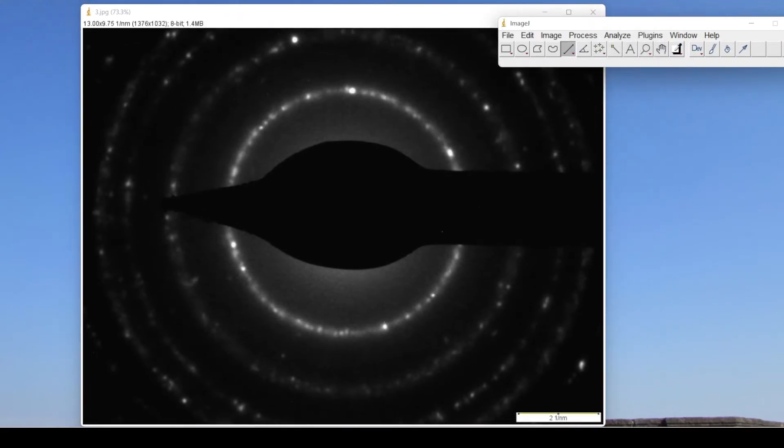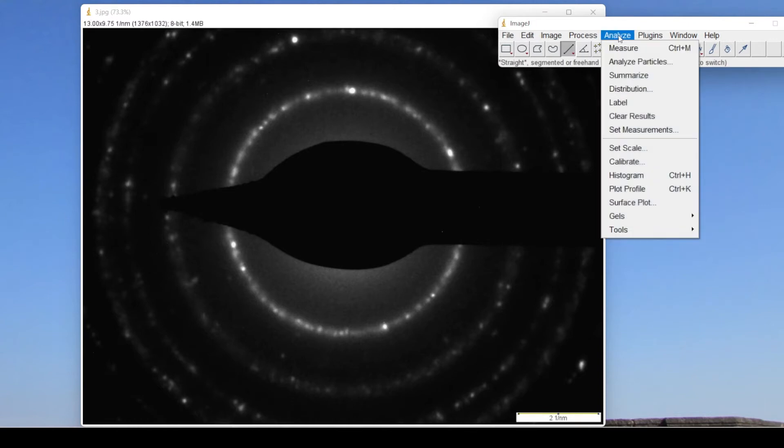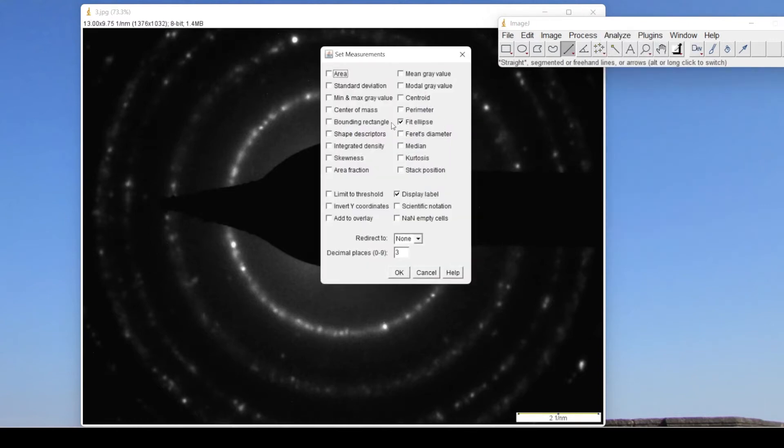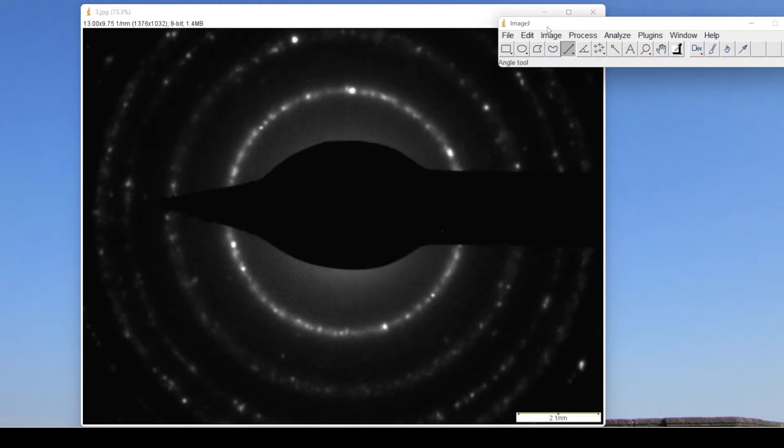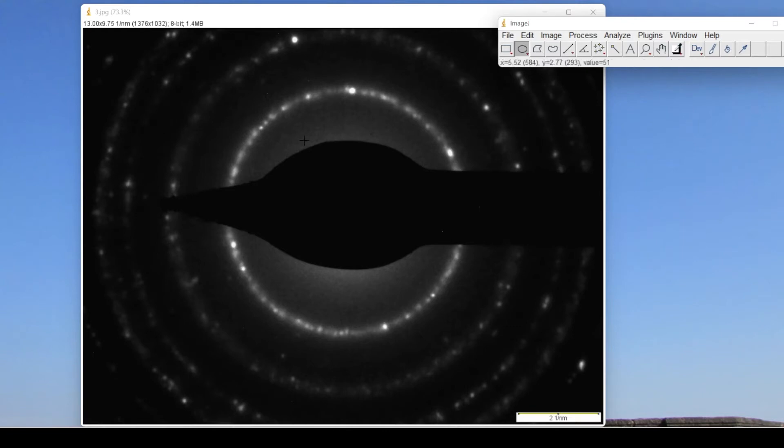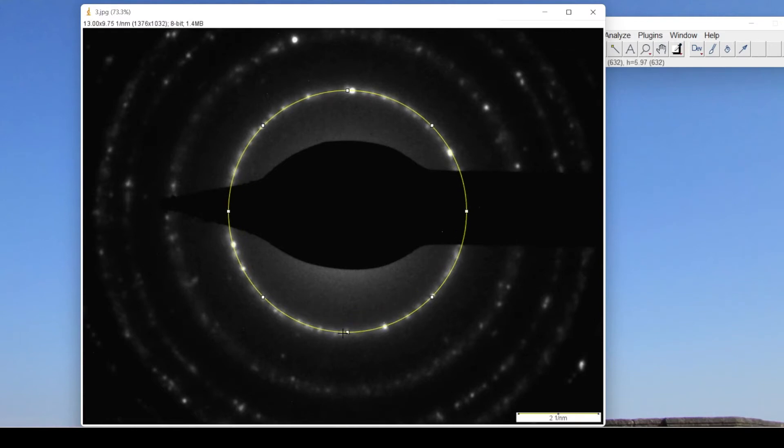Now before measuring the diameter or radius of this particular ring, we have to set the size of the SAED pattern. Now select this ellipse tool, press shift and select this. Okay.